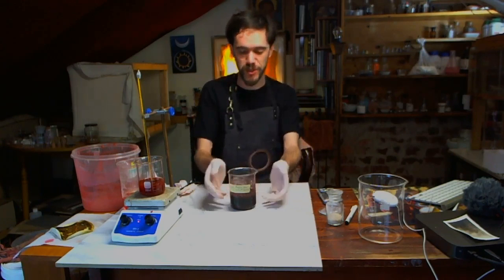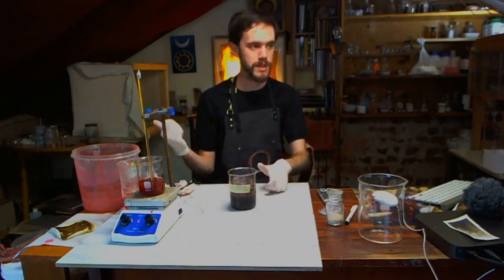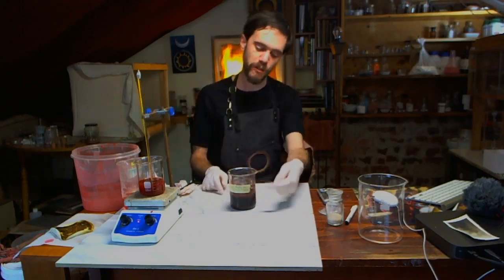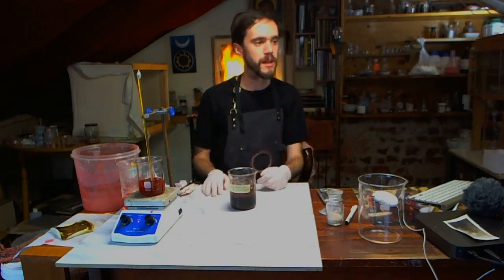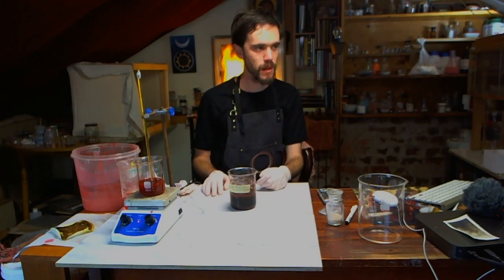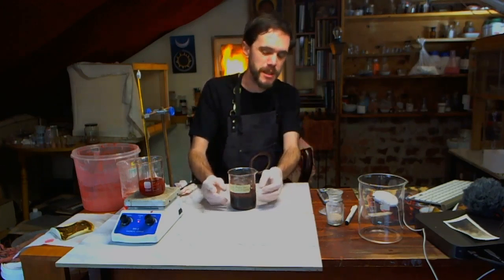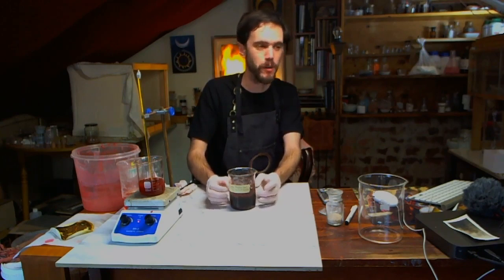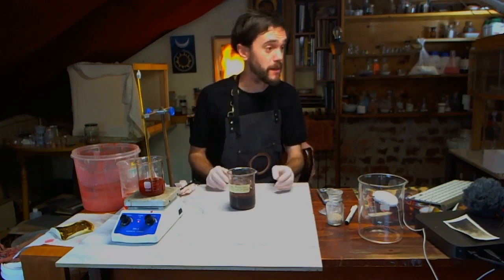So I've done 9 grams in 200 mils of water or something. Anyway, then we filter off the residue and we keep the root material and discard all the rest of it, because the sodium sulfate should extract tannins and things that we don't want in our final color. So we'll start by doing that.